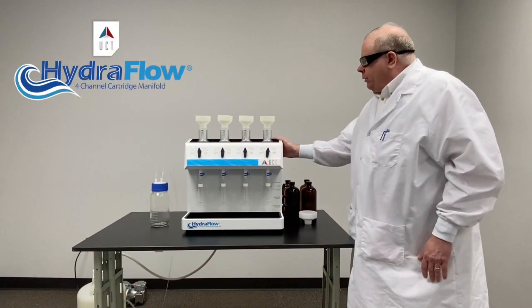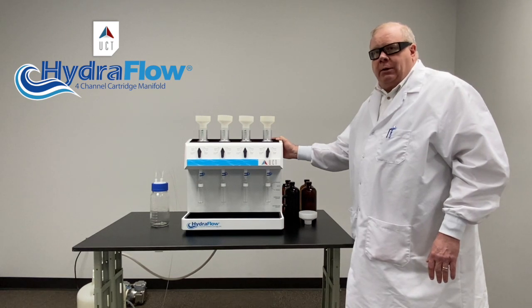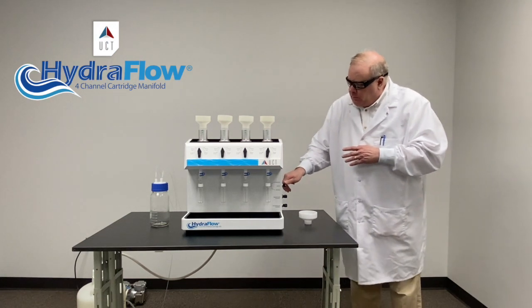The entire pathway in this unit is inert, so you don't have to worry about anything breaking down — no leaching. Very simple to use. Let me show you some of the features on the unit.